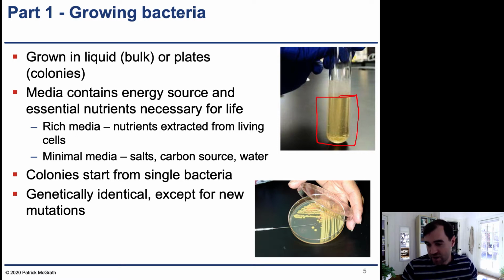And so in this case, the bacteria can actually grow on top of the agar. You can see these thick yellow lines. That is all bacteria, as well as these circular dots. These circular dots are known as colonies. Whenever we refer to a colony, we're referring to a single circular dot. These lines are not colonies. They are still bacteria, but because they don't have that dot-like shape, you typically don't use those.